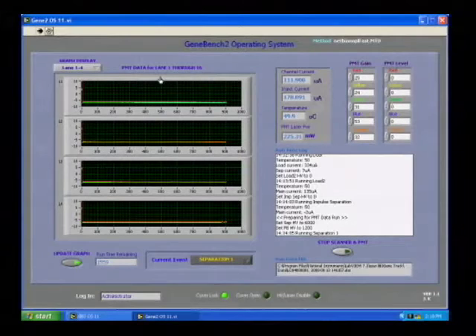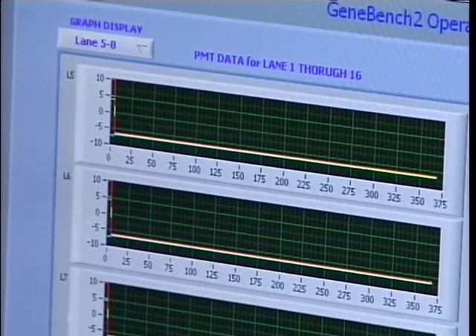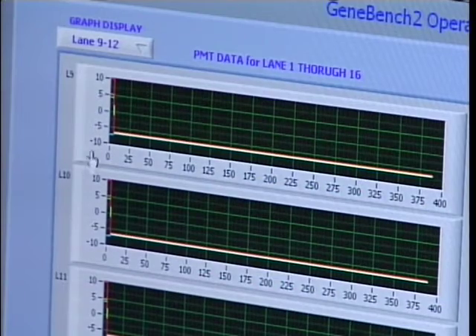We're at the portion of the run where the primers — the smallest fragments of DNA in the PCR product — are making their way from the cathode side down to the anode side, and we expect to see primers appearing very shortly. The protocol we're running is the FAST protocol, which can complete separation of 400 to 500 base pairs in 15 minutes. Primers are now being detected across lanes one to four, five through eight, nine through twelve, and thirteen through sixteen.